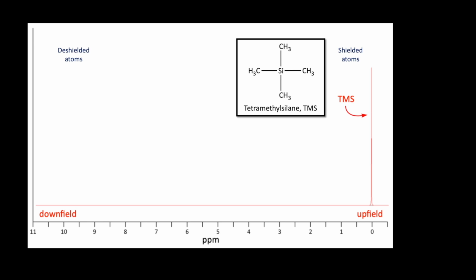And the chemical that shows us where 0 is, TMS, stands for tetramethylsilane. Tetra because there are 4 methyl groups, these methyl groups right here. And those 4 methyl groups are on a silane, a silicon. The reason that's important is silicon is not very electronegative. It's below carbon, so a chemist might say it's electropositive. It tends to release electrons away from it towards these hydrogen atoms.